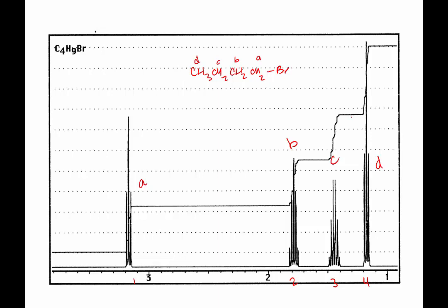So how'd you get D was 4? Whoever suggested that, did you suggest that? Because it was the biggest peak and the most hydrogens around D. Okay, and integration-wise, if I look at these integration markers, it's like 3, so it would be the biggest peak, with the most integral.